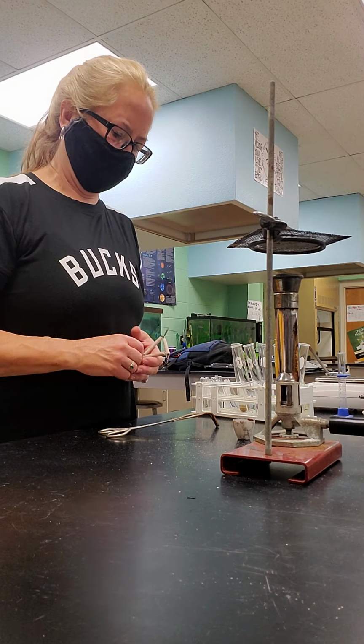Okay, now here is our, let's see if you can see this. You see that? That's our copper. So it has gotten a precipitate. Okay, so if I were to drain away the liquid, so I decanted the liquid. There's my precipitate in the solid. And I'm gonna dry it off and we're gonna mass it again.